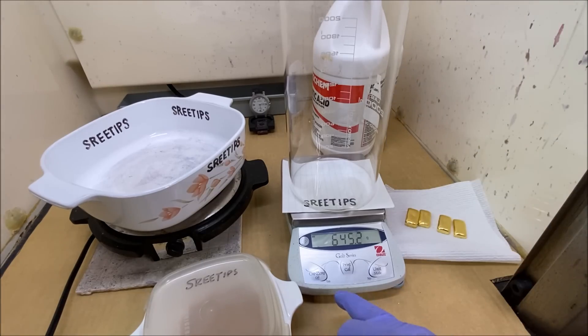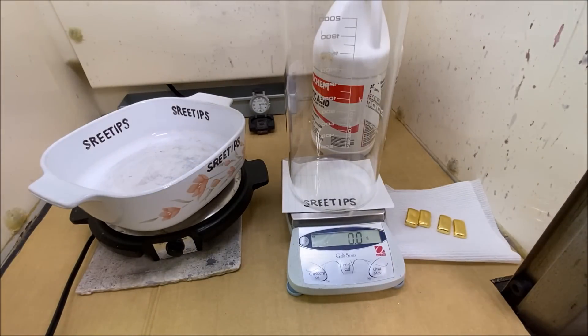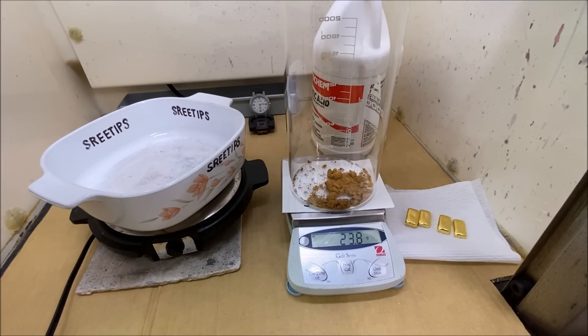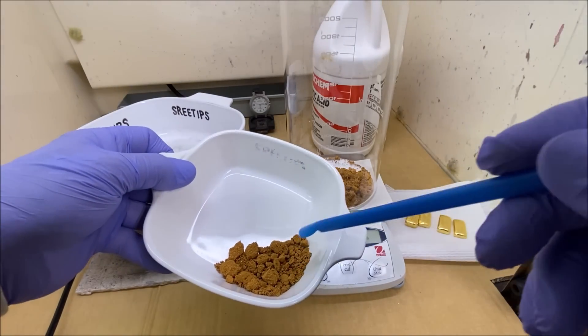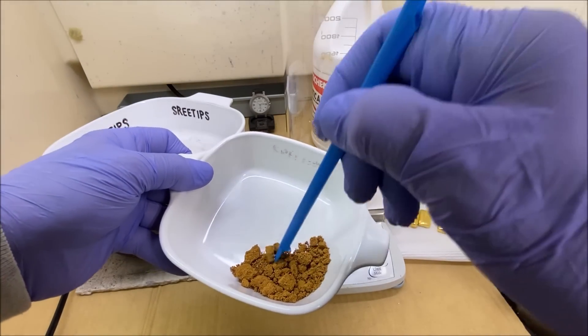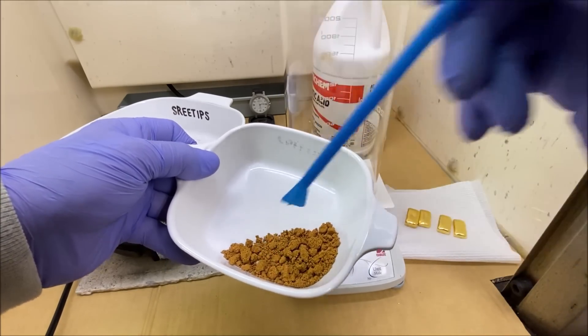To begin the experiment, we're going to put 90 grams of this pure gold sponge into this beaker. There we go — 90.2 grams. I've got a little bit of sponge left over, and I'll offer some of that for sale on my eBay site, selling it by the gram.